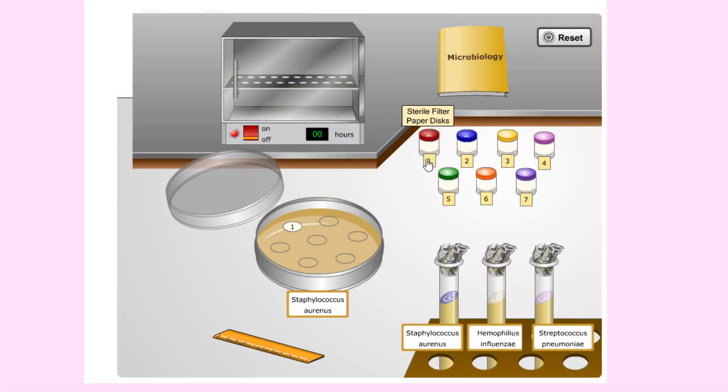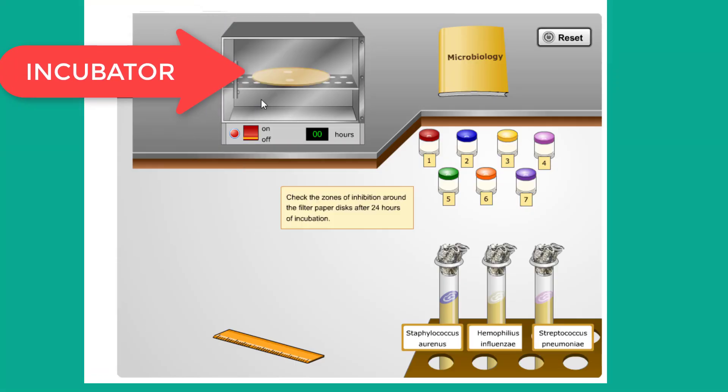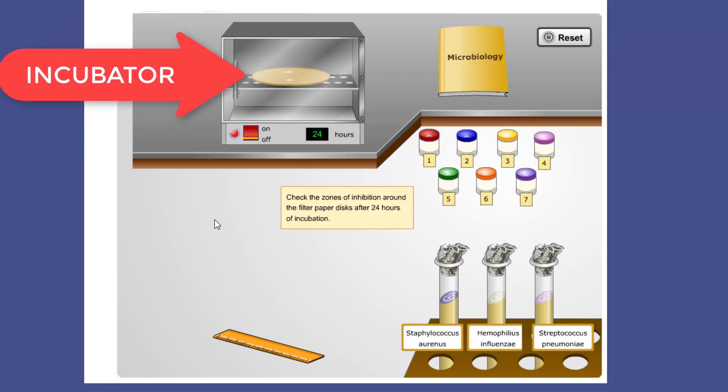After inoculating the agar in the petri dish, we will drag a disc from each of our vials and place it on the petri dish. In order to avoid contamination, these discs should not be moved after they have been dropped into the petri dish. Next, we click on the incubator to place the petri dish into it, and click the red button of the incubator to turn it on.